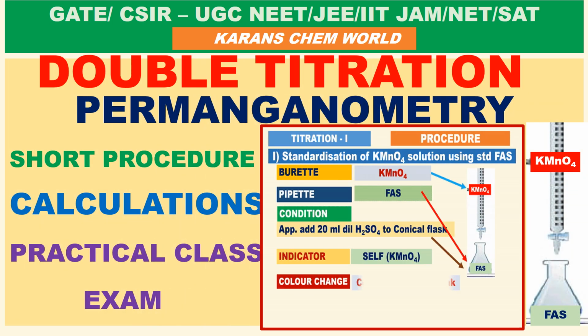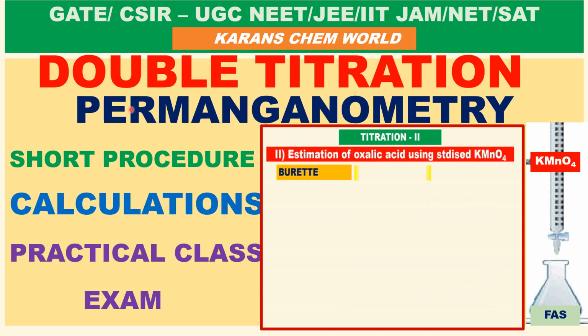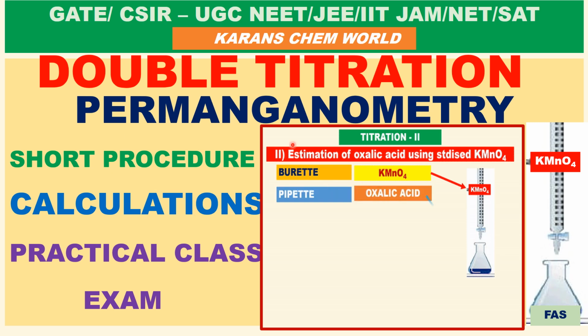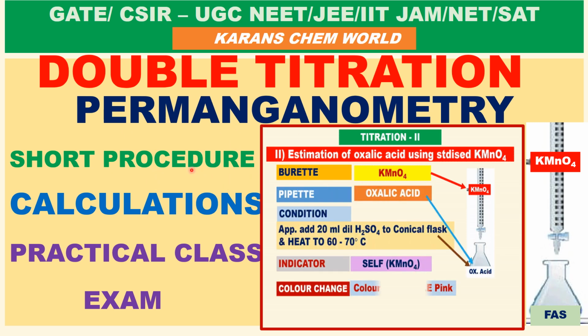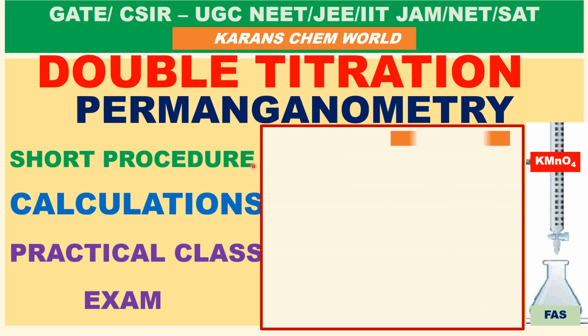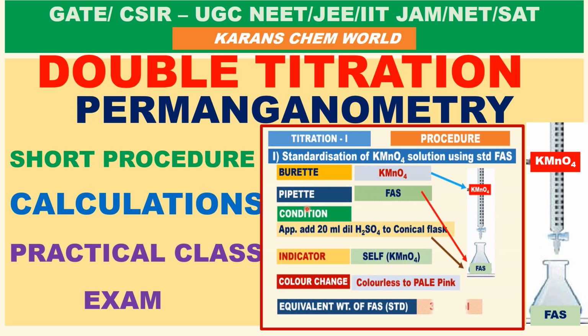In this video, let us study volumetric analysis. In volumetric analysis, double titration, especially permanganometry, is most often asked in the practical exam: how to write the short procedure and how to carry out the calculations. Okay, you will see in detail.